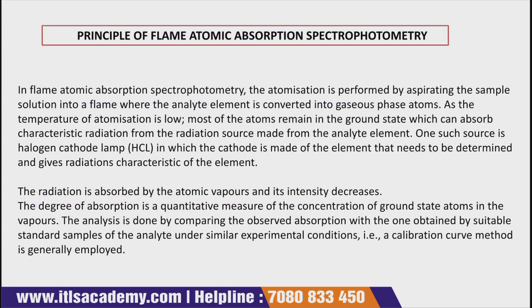Now let's move further and discuss the principle of flame atomic absorption spectrometry in detail.